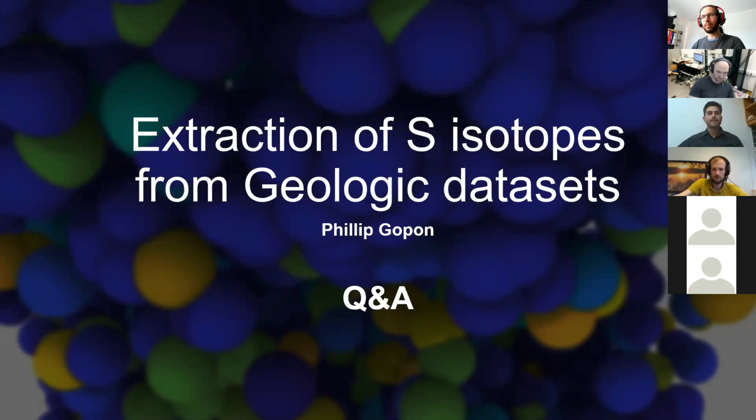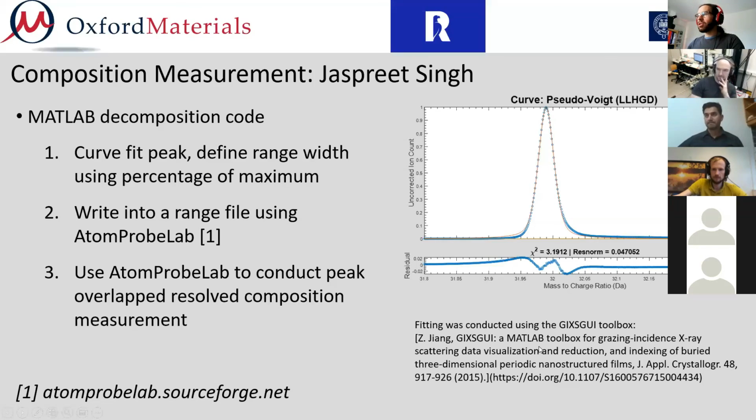Okay. Again, great. It's always something I'm interested in. So just briefly, you mentioned Jesse's peak fitting. I thought it'd be worthwhile just to explain for people. This is a slide that he sent me. He's using a MATLAB toolbox that was, I think, originally developed for X-ray peak analysis, but it's a general peak fitting tool. And he's been using this to quantify the counts from peaks. And I believe Phil's been using this code. So just to put that up there and mention that's what they've been doing.